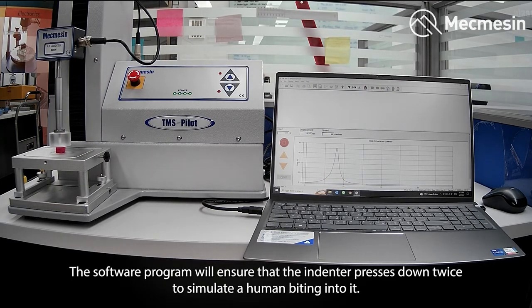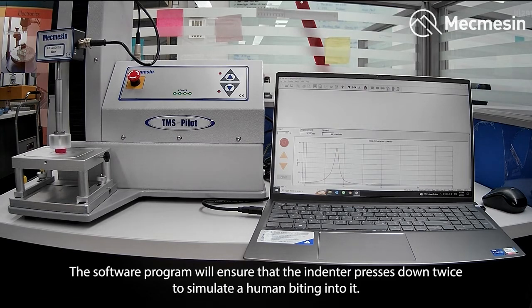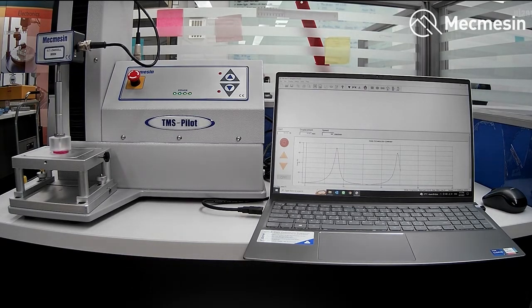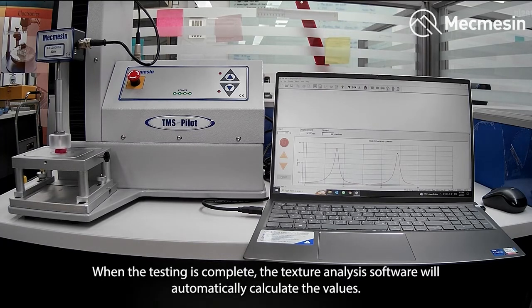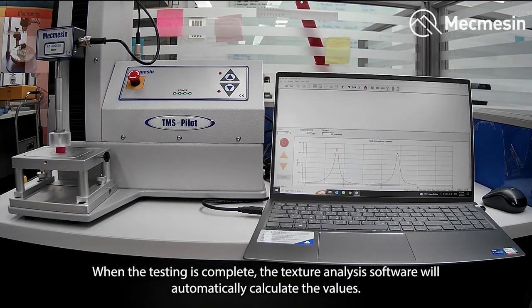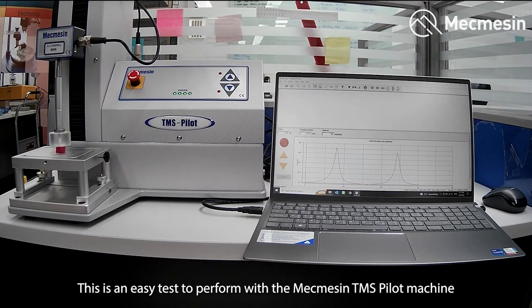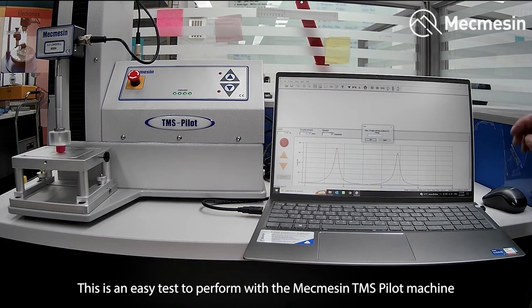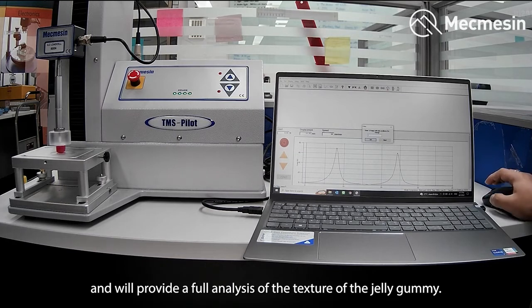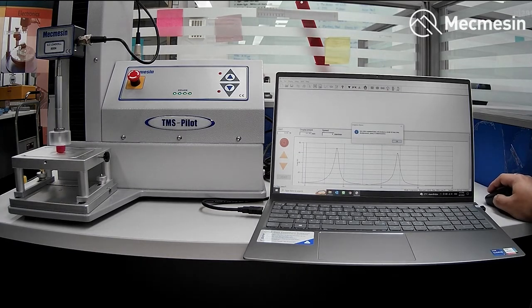This is to simulate a human biting into it. When the testing is complete, the texture analysis software will automatically calculate the values. This is an easy test to perform with a Mecmesin TMS Pilot machine and will provide a full analysis of the texture of the jelly gummy.